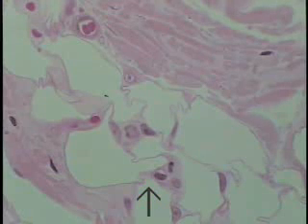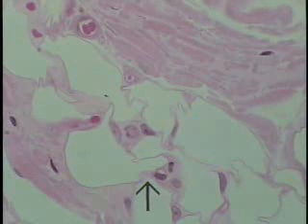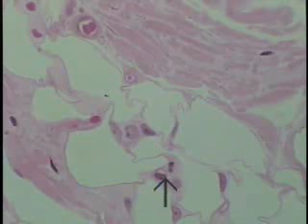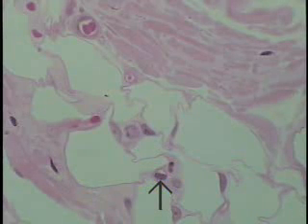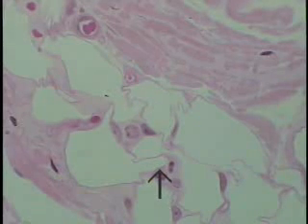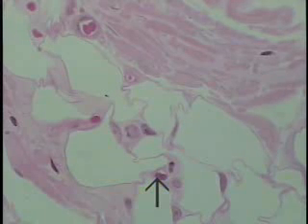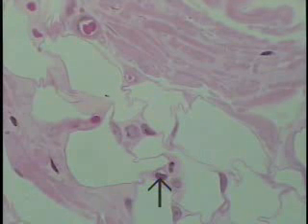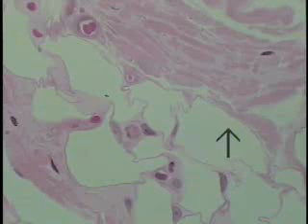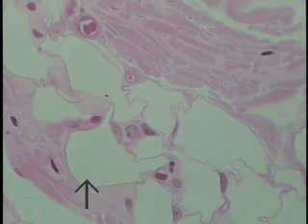Examples of capillaries as seen in a plastic section at high magnification. An example of one is shown at the tip of the pointer. The nucleus of the endothelial cell touches the tip of the pointer, and one can make out a small empty lumen. So this is a relatively small capillary, with a luminal diameter perhaps smaller than that of a red cell. These are adjacent fat cells to give some perspective to the size.